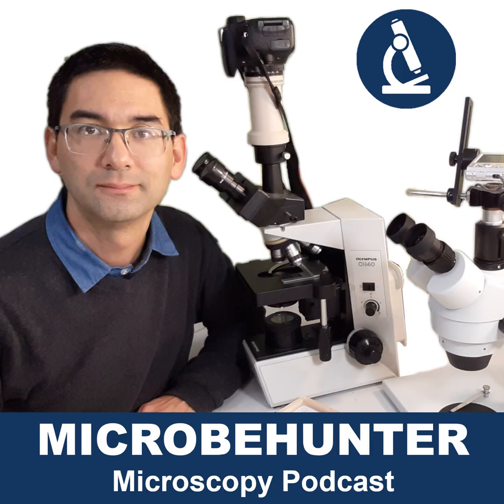If you want to observe yeast cells, and often in biotechnology you observe yeast cells because you're into brewing or alcoholic fermentation, you use yeast, then you can already see these cells with a total magnification of 100 times very easily, 400 times of course as well. And if you want to determine the cell count or the cell density, then you also need a special slide called a hemocytometer. They do not cost very much, and then you can determine the cell count.